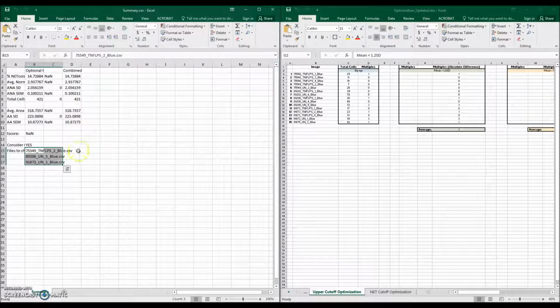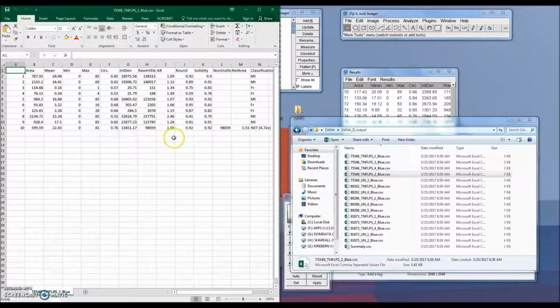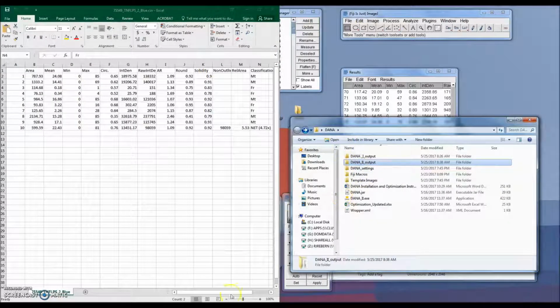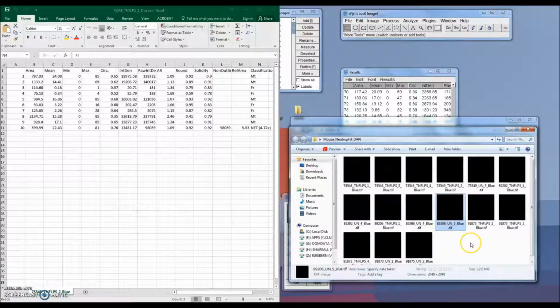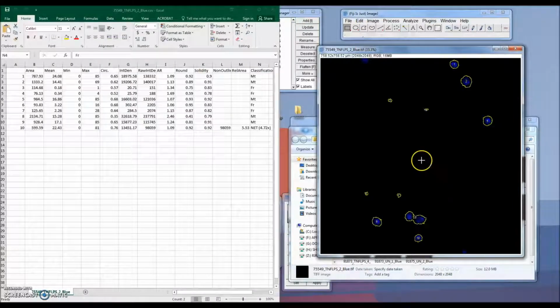I'm going to open 75549 TNF-LPS2. It's giving me a decent number of 4 fragments, so I can open that actual image, 75549 TNF-LPS2. Okay, so I will run Dana on this. It's going to fit that.